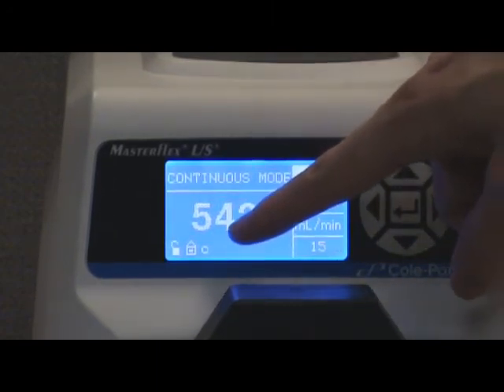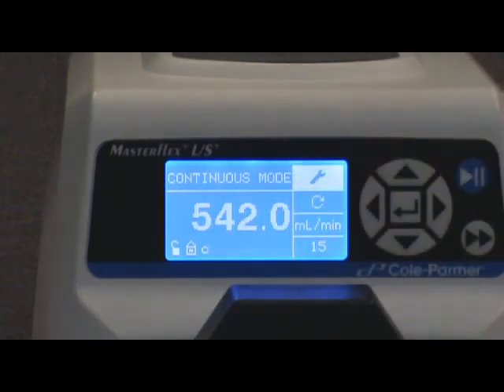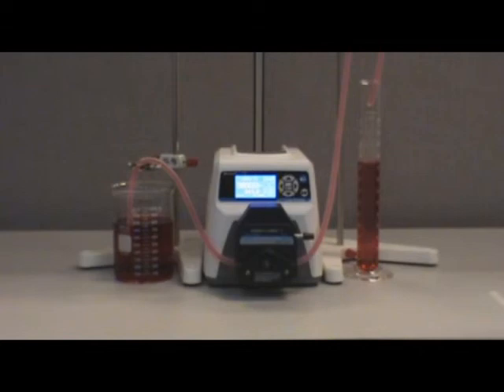At this point you will see a small C in the bottom left hand corner which indicates that the pump has been calibrated. If you find that your calibration volumes are varying significantly, make sure you follow the break in procedure for your tubing, running it at full speed for 10 minutes.